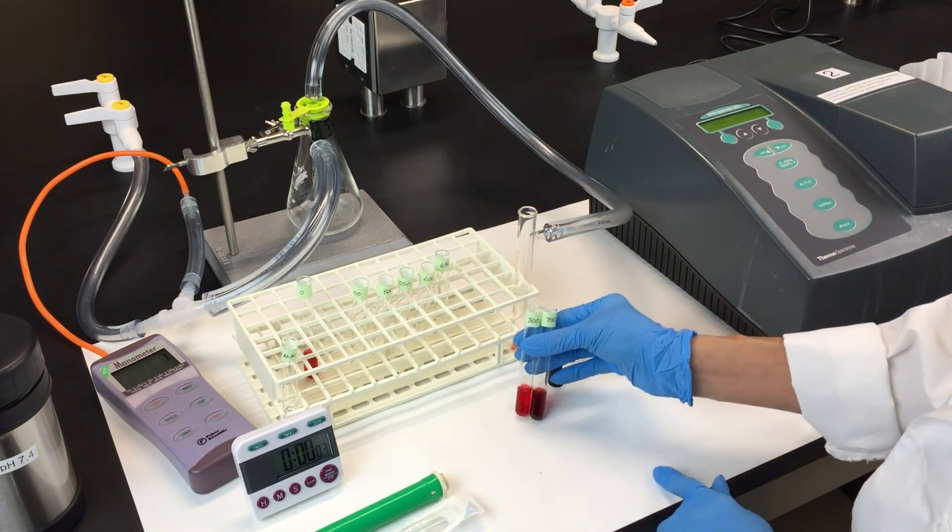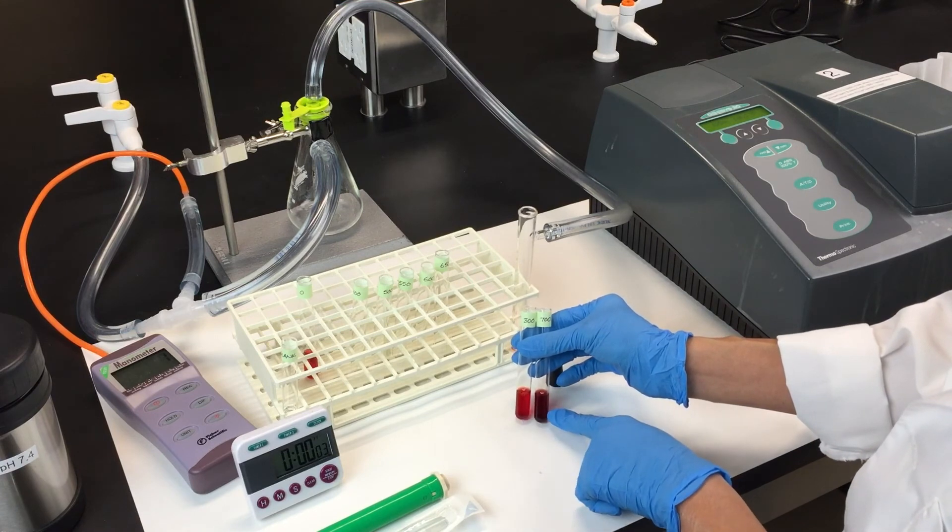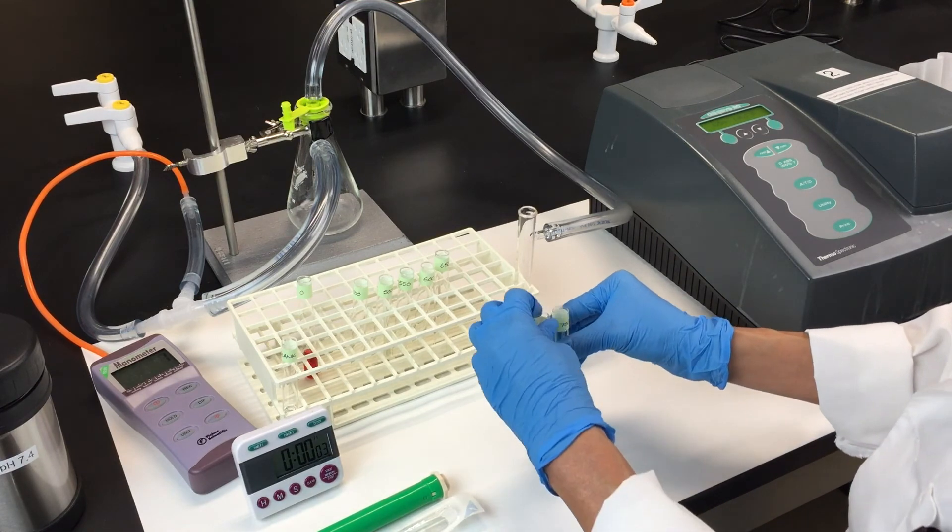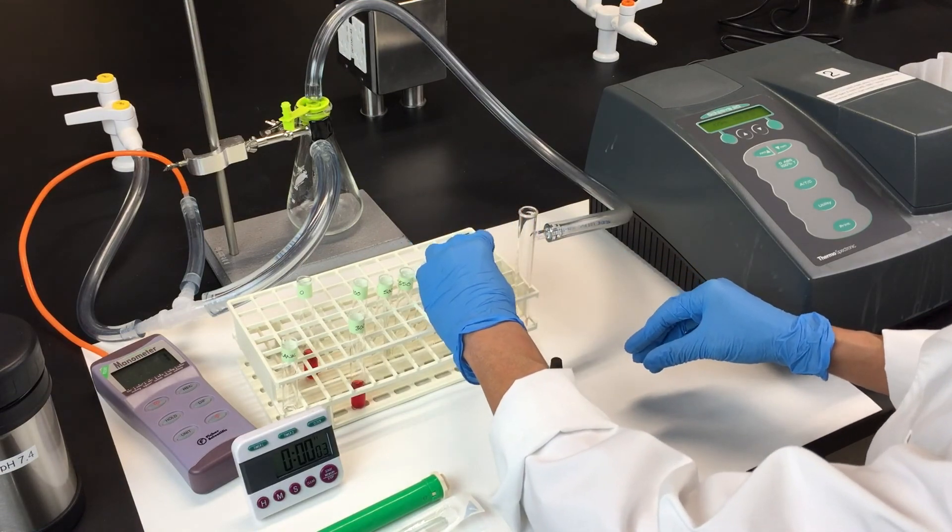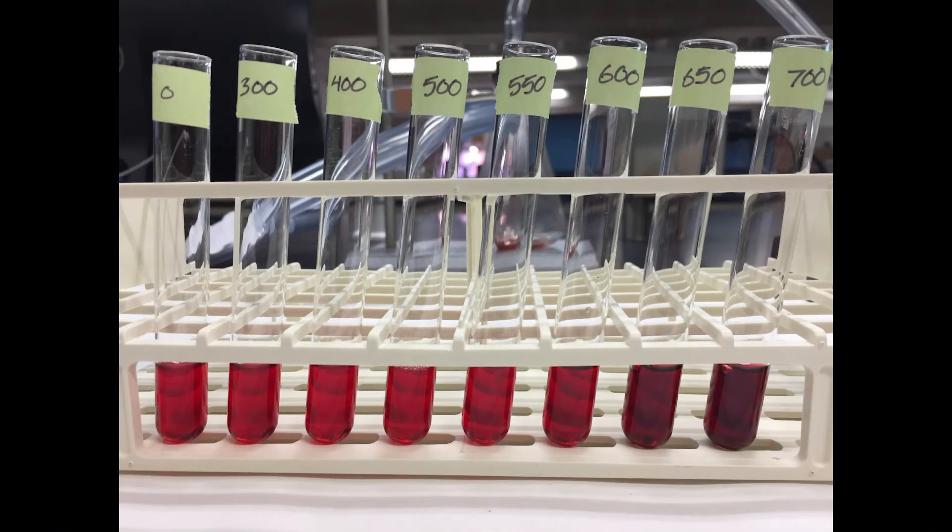Here you can see the difference between the 300 and 700 millimeter mercury tube. Once you've finished all the vacuum pressures, your tubes should look something like this. You can see that the hemolysate gets darker as it becomes more deoxygenated under higher vacuum pressures.